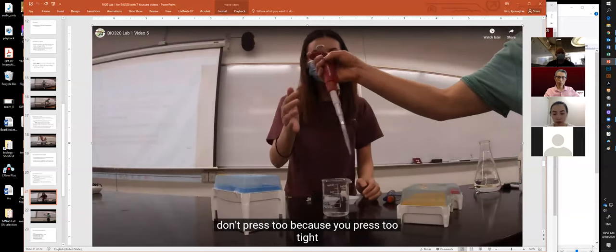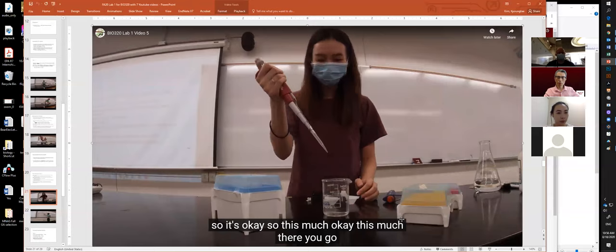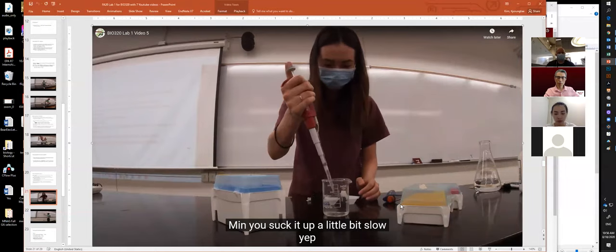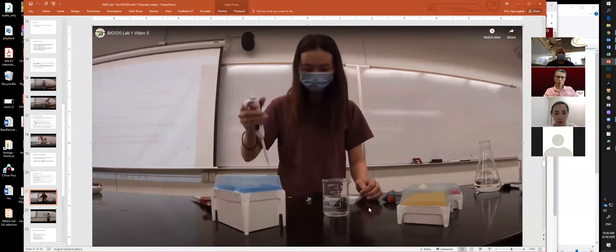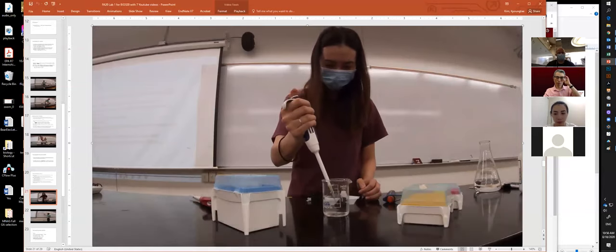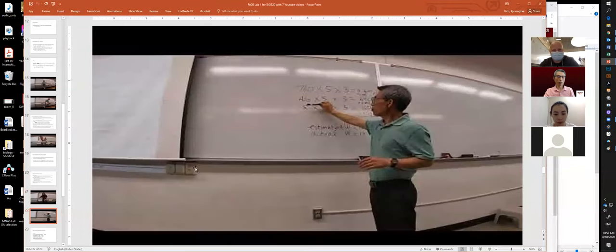Don't press too tight, so it's okay. So this much, okay. This much. When you suck it up, go a little bit slow. Next. So we did it this way. We're going to stop it here and then move on to our breakdown.